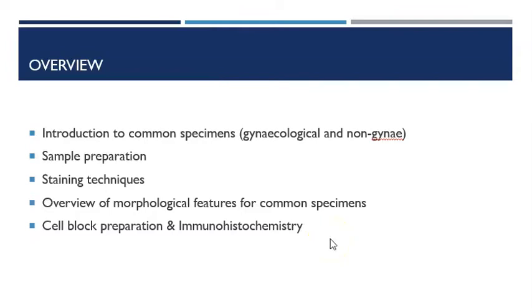However, it's clear that histopathology can really only be done where you can take a full depth tissue biopsy. In certain clinical situations that is just not possible, so a lot of the samples we'll be dealing with here will be analysed by cytology, and then if possible a follow-up biopsy will be taken, which will be analysed by histology.